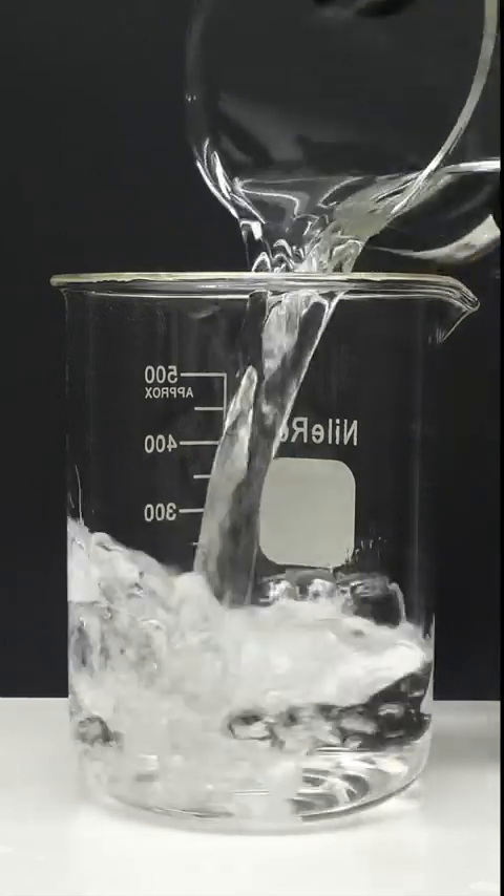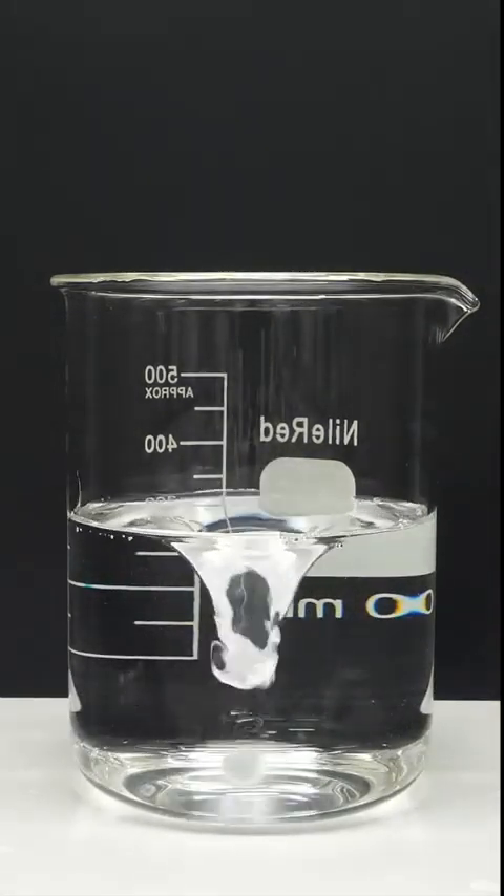For this one, I'm gonna try and synthesize a bouncy ball. To get things started, I'll add about 300 mils of water to a beaker, and I'll turn on the stirring.